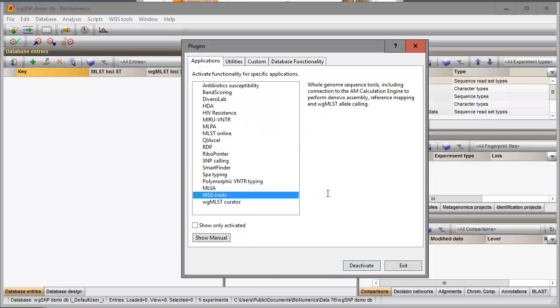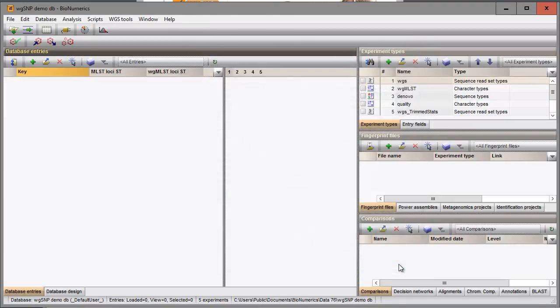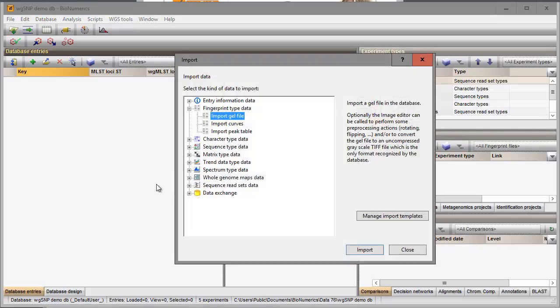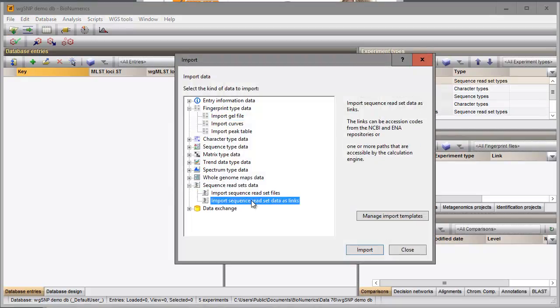After installation of the plugin, I go back to the Import dialog, where a new Import Routine is available in the tree.